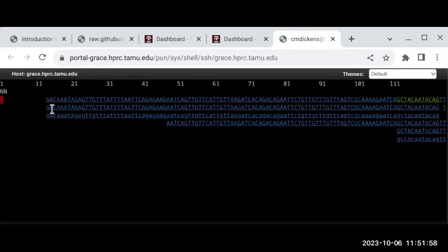So look, these 3 here, these bottom 2 here, they have the same start and end alignment coordinates. You can see over here, they stop here. So this is probably a PCR duplicate. Like when you increase the DNA that's in a sample, you run PCR and you get more of the same fragments. Sometimes you need that to actually fill the sequencer, but when you're calling variants, you'll want to remove those duplicates. So that's why you see these start at the same place and end at the same place.